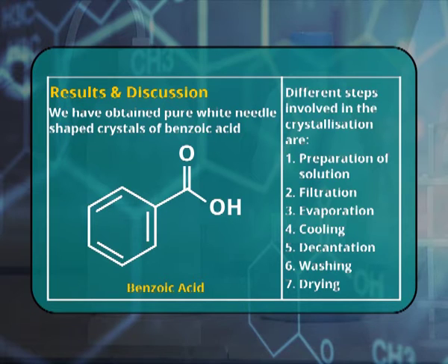The different steps involved in crystallization are preparation of solution, filtration, evaporation, cooling, decantation, washing and finally drying.